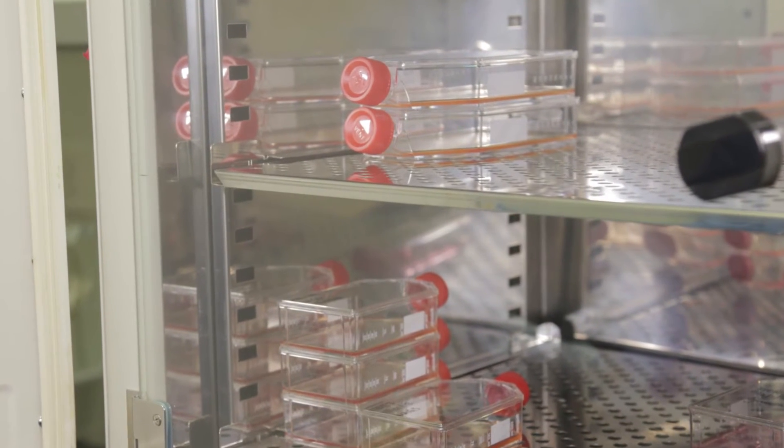All ELISAs will have two core components. One is the use of an antibody to bind a specific target antigen of interest, and two is the use of an enzyme to detect the presence of that antibody. Today I'm going to take you through perhaps the most commonly used of all the ELISA techniques, the sandwich ELISA, which I'll be using to detect the presence of the cytokine interleukin-6 in the culture medium of macrophages I have been growing.